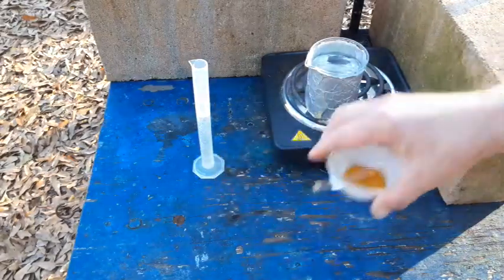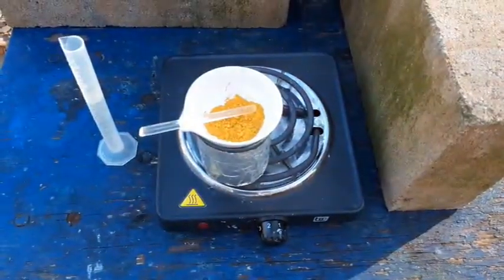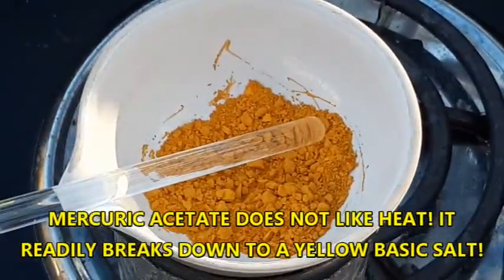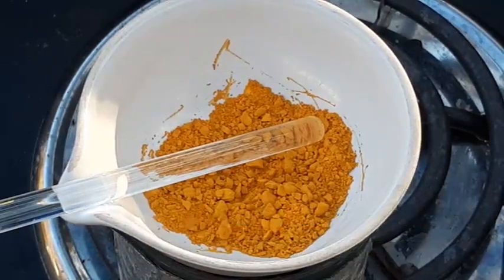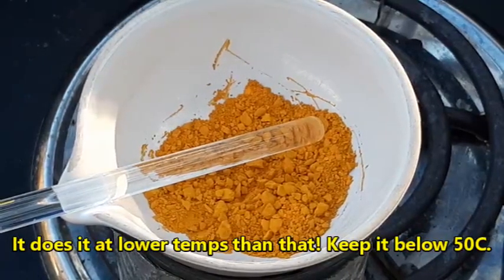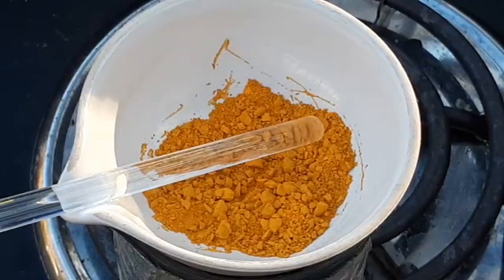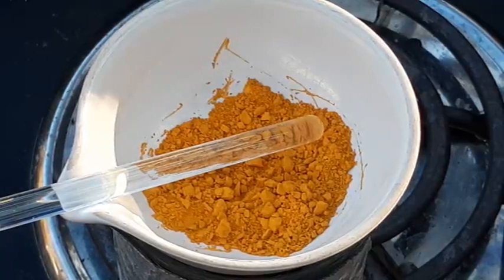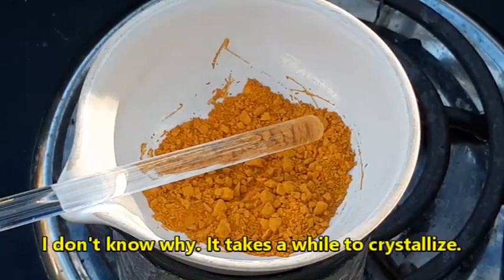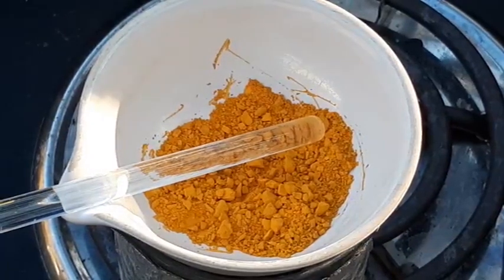We're going to put this on a hot water bath right at 50 degrees Celsius. The textbook says mercuric acetate will decompose around 100 Celsius, and I don't know at what point it starts to do this, so we're going to keep the temperature moderate. We're probably going to have to heat it up a bit because the textbook talks about filtering through a jacketed filter heated with hot water — obviously I don't have that, so I'm going to improvise.